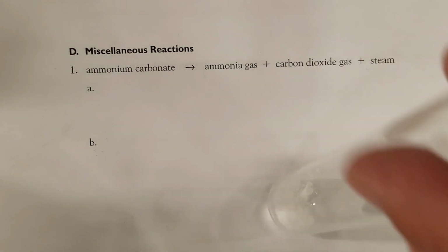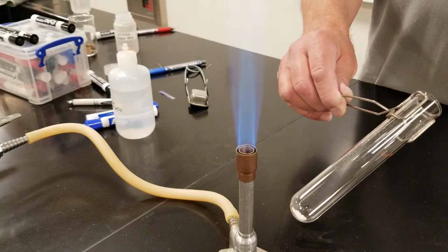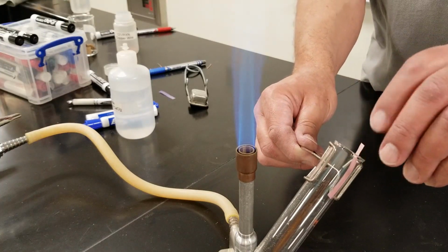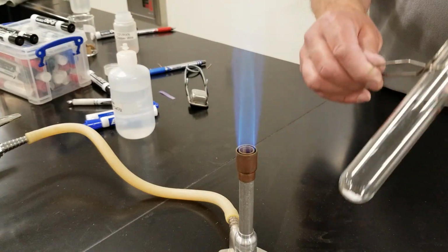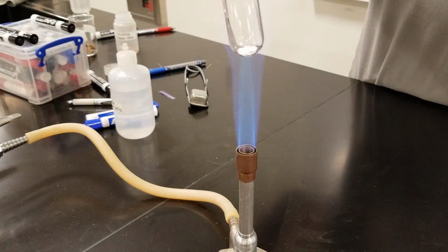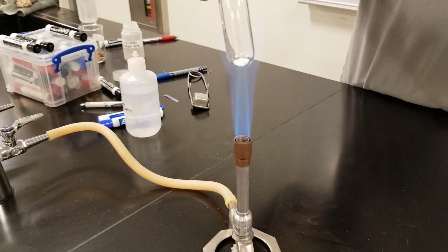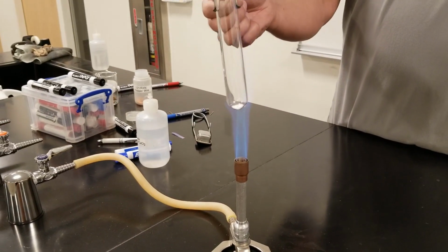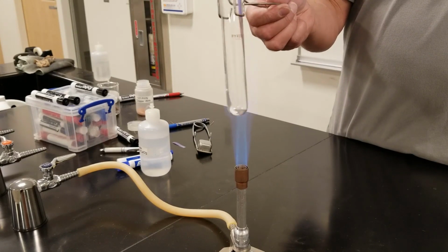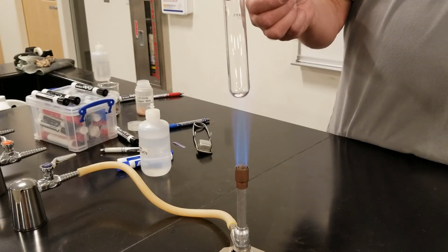Okay, here's our ammonium carbonate, and I'm going to affix some red litmus paper to the mouth of that test tube and start heating it. And as I heat it, it should decompose, giving us ammonia vapor. Ammonia is basic, and hopefully you saw how that red litmus turned blue, because the ammonia gas is a base.